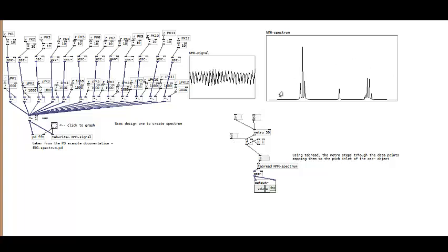This is again ethanol to start with. Let's have a look to see how that sounds. So we play through, and we'll get, that was these 2 peaks, and then as it comes up we'll get this peak here, and then 4 peaks coming now. Cool.